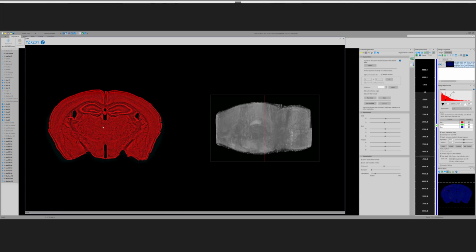There's compression in the y-axis, and that can be adjusted by doing an atlas calibration, but can also be adjusted when we do the registration here. The other thing is that in experimental brains, the position and shape of different structures gives us an indication of where we are in the rostral-caudal axis.